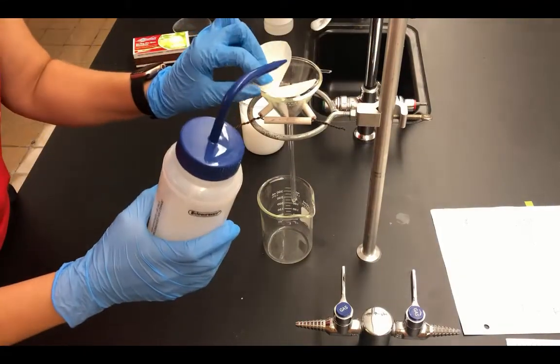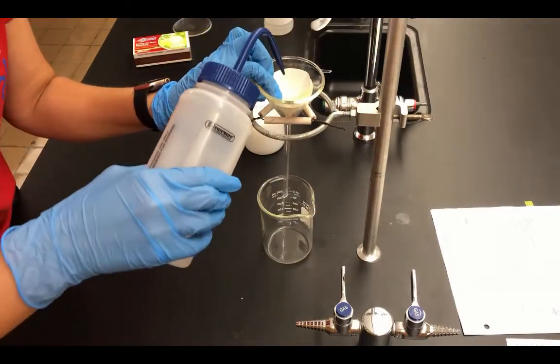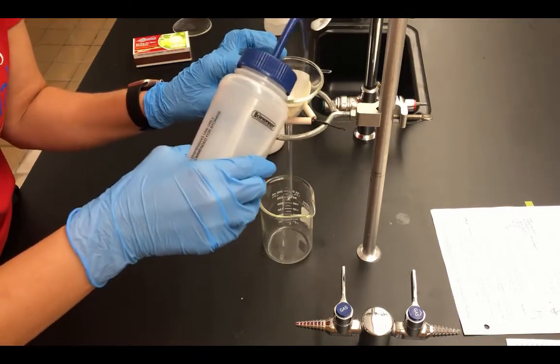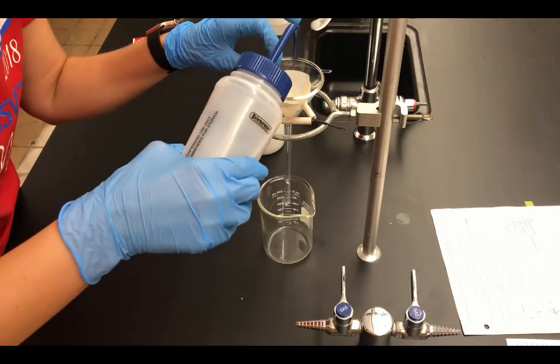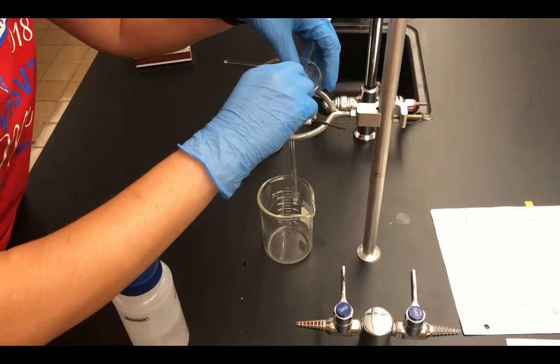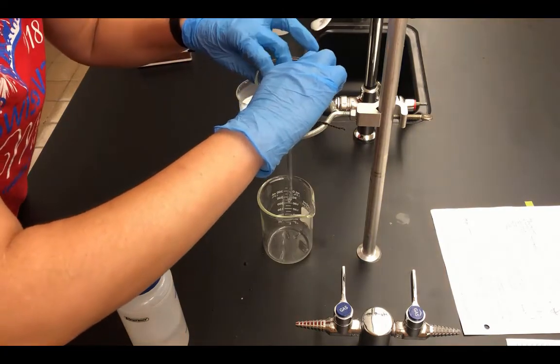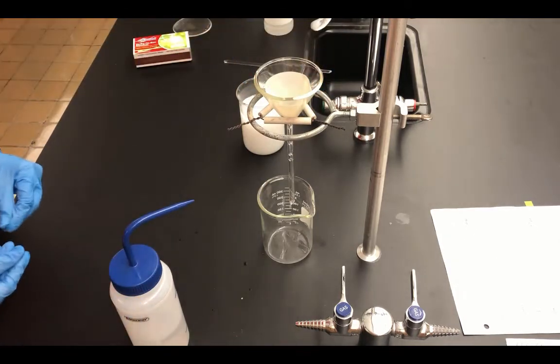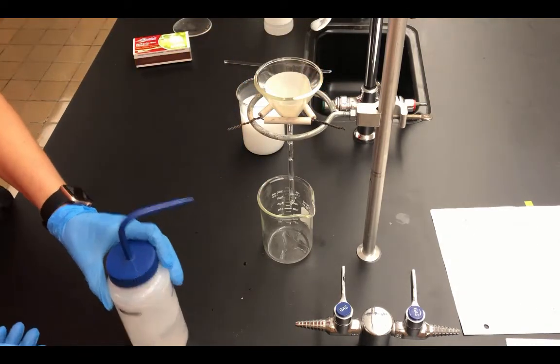What you can do is take some distilled water and just squirt some distilled water around the filter paper. And what this allows you to do is create a seal in the funnel. And notice how now it's dripping out.